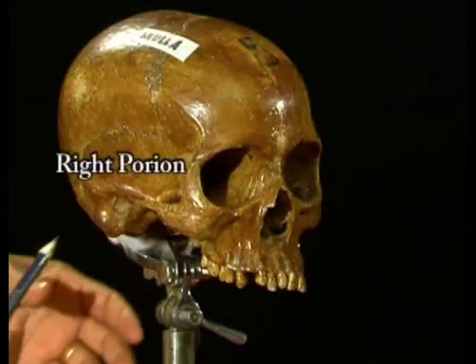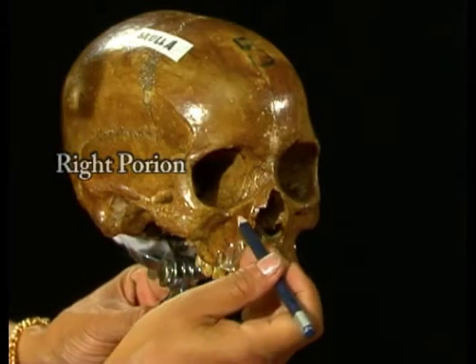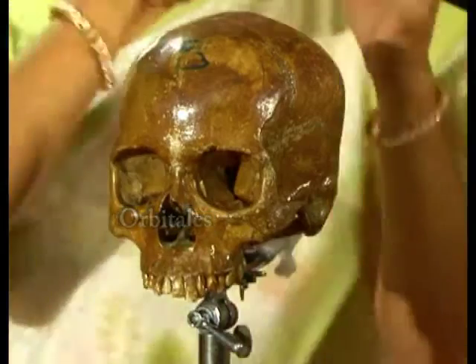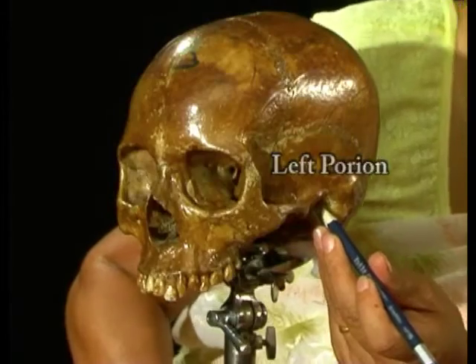The Frankfurt horizontal plane, or in short FH plane, is based on placing the right and the left porion and the two orbitales in the same horizontal plane. It is used as a constant plane of reference by the physical anthropologist when he is measuring and describing skulls.